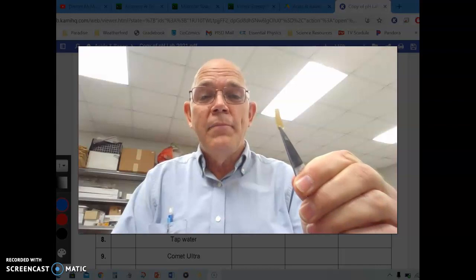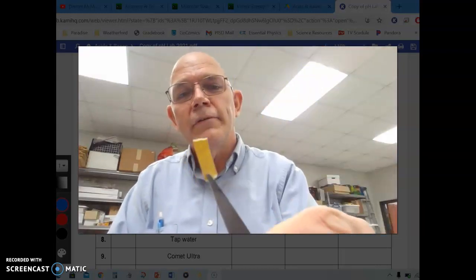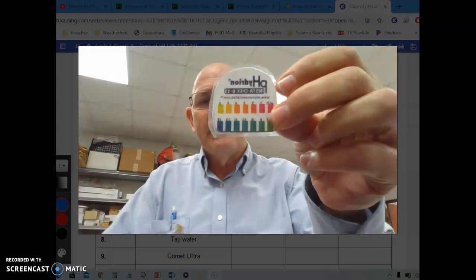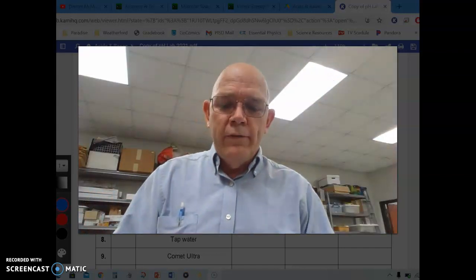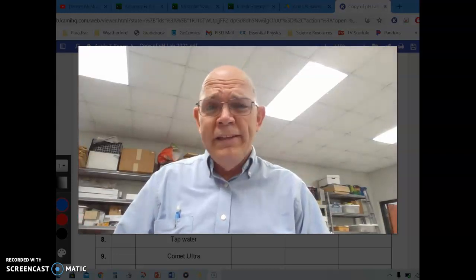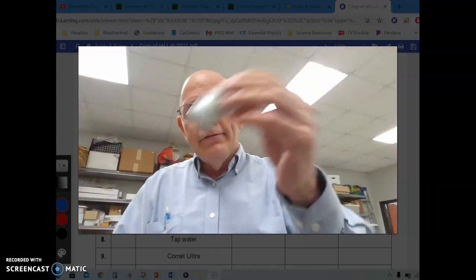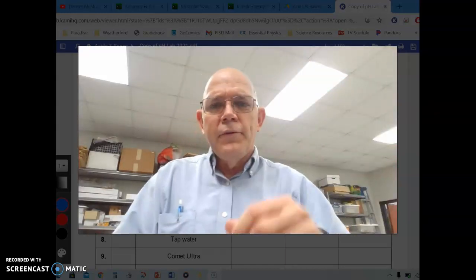We're going to use pH paper, which is this yellowy colored paper, and we're going to put it in different substances. It's called an indicator because it will change colors, and these are all the different colors it could change. Then we'll compare it to this to see what the pH of our liquids are. We took a bunch of different household cleaners and other things you might find around the household and put samples of them in little bottles, and we're going to take them and see. To start off with, we're going to do tap water.